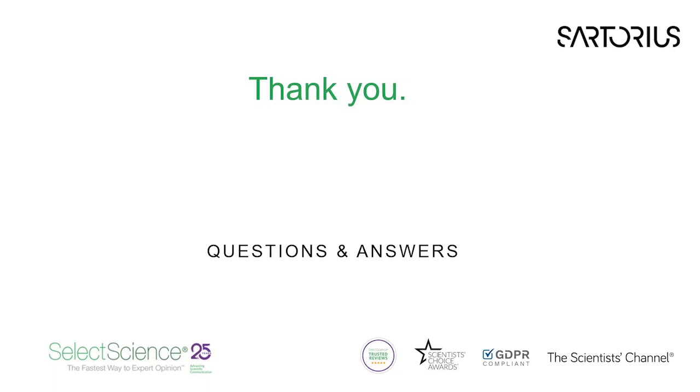Okay, so on both of those issues, the capillarity, I can't say the word today, and the fact that the liquid moves up, both of those are taken into account by the pipette and tip manufacturers. We're well aware, obviously, capillarity happens. So in terms of accuracy and precision, I wouldn't necessarily be concerned about that, because as I said, it's taken into account in the design of the product. If you're still a little bit unsure, then obviously pre-wetting tips, so that's when you take liquids up and then dispense afterwards, always helps to ensure that you're getting accurate results. And obviously, again, especially if you're using difficult liquids, you can always use reverse pipetting.